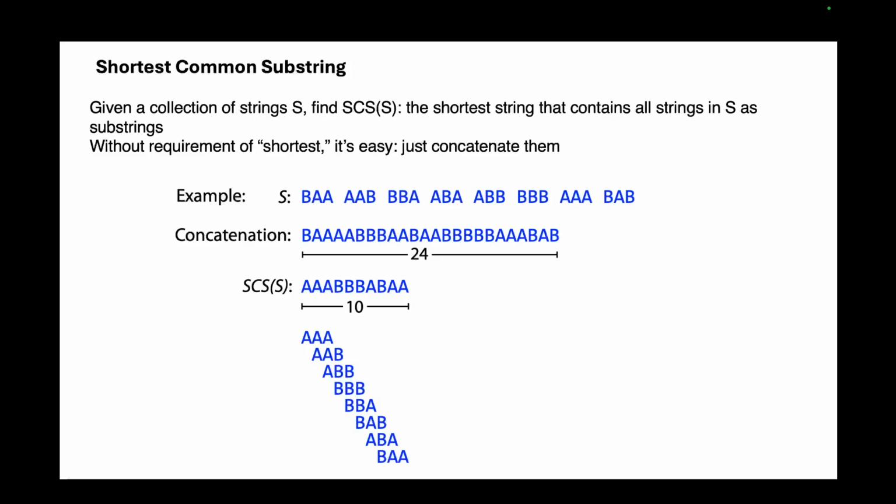Now, this is a very telling problem in terms of genome assembly because of the amount of time and space this algorithm will take. We'll see that in the further slides.